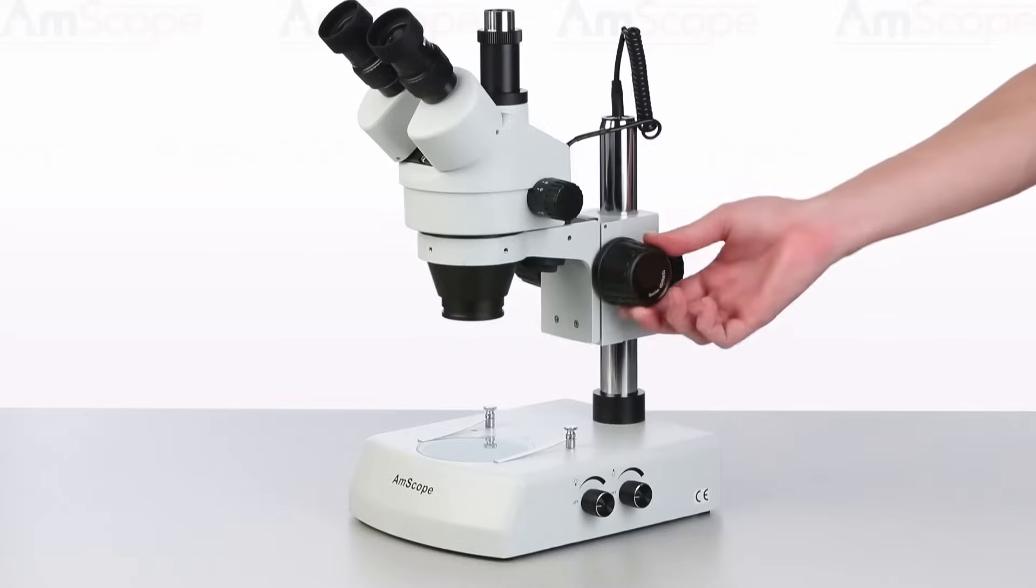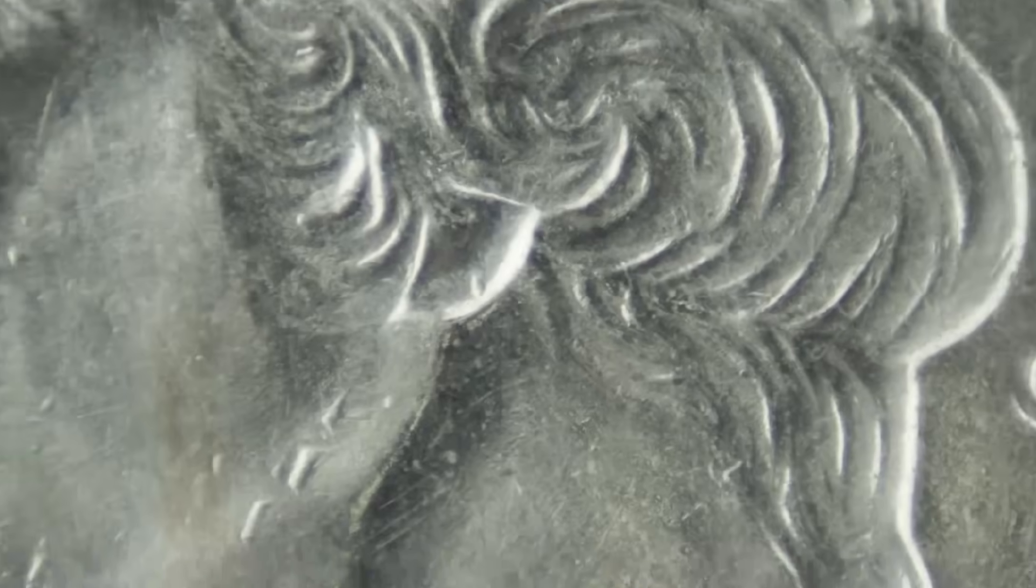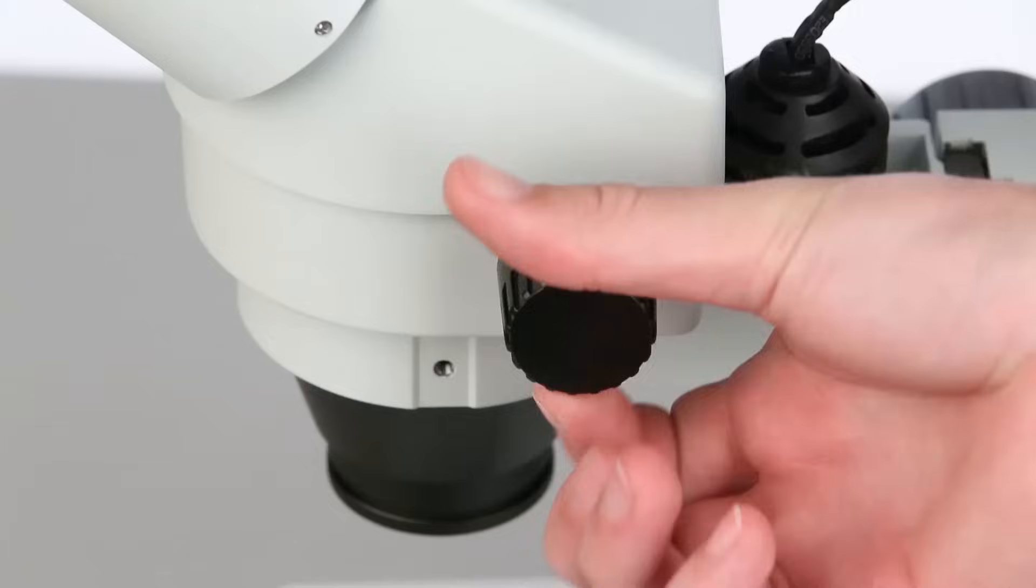To test the focus accuracy, focus on a test subject at low magnification, then move to the highest magnification to fine tune the focus point. Now move through the zoom range, making minor adjustments to the diopters as needed until the focus is relatively consistent.